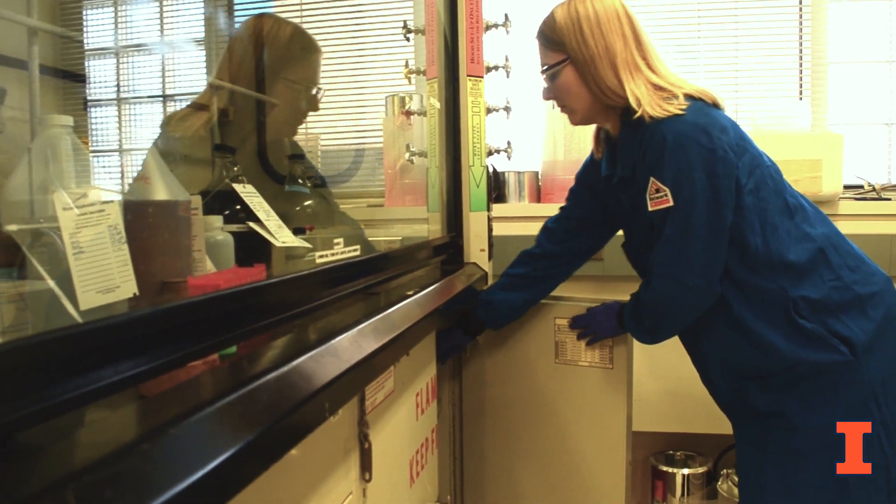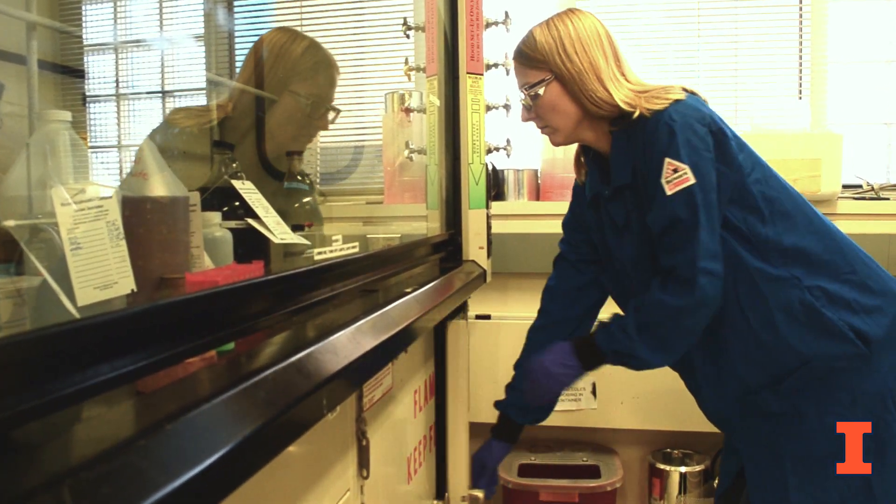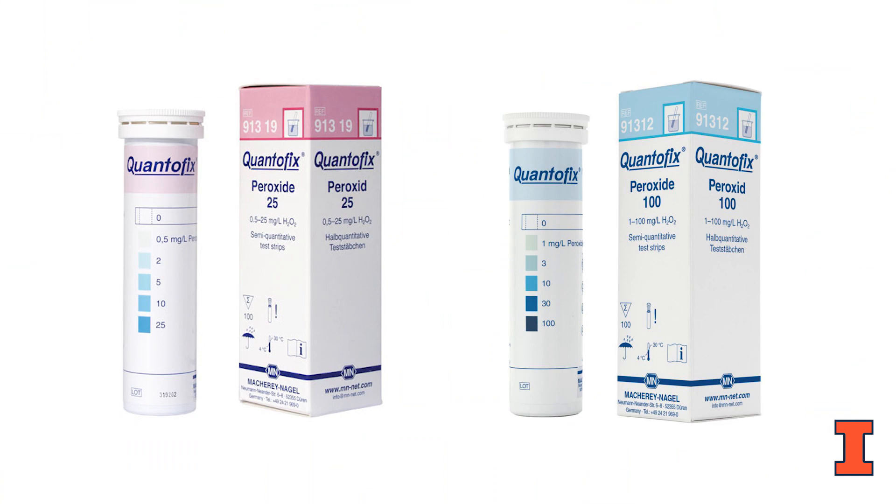Store peroxide forming chemicals away from heat and light. You can purchase peroxide test strips from the storerooms across campus.